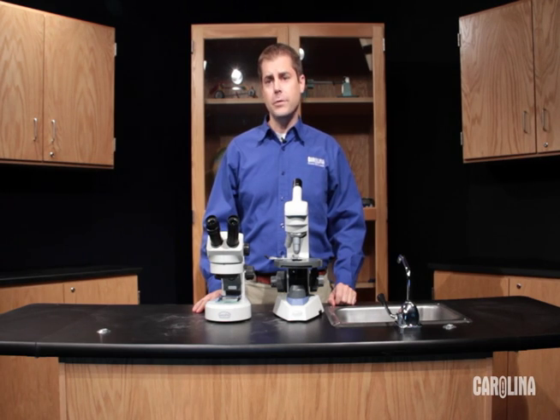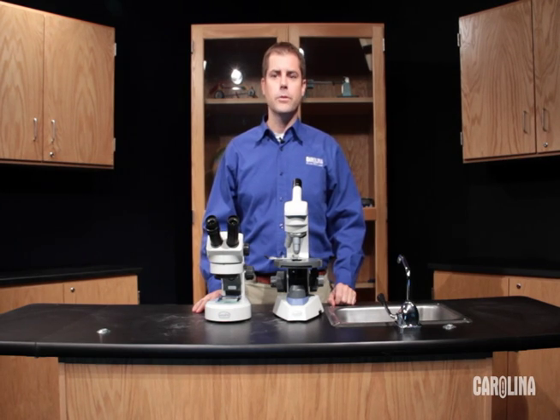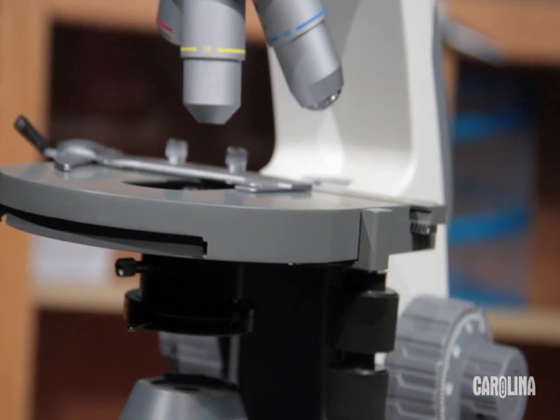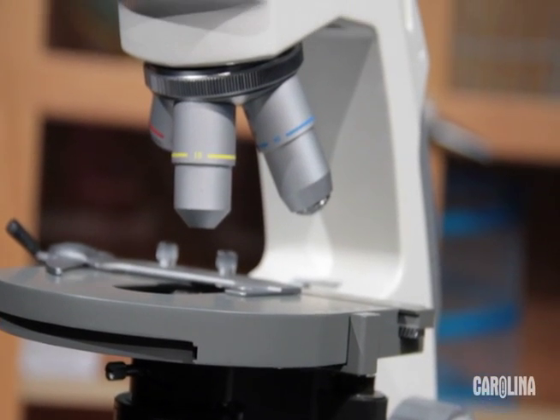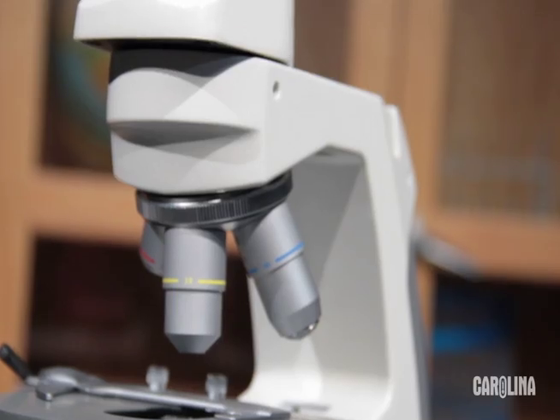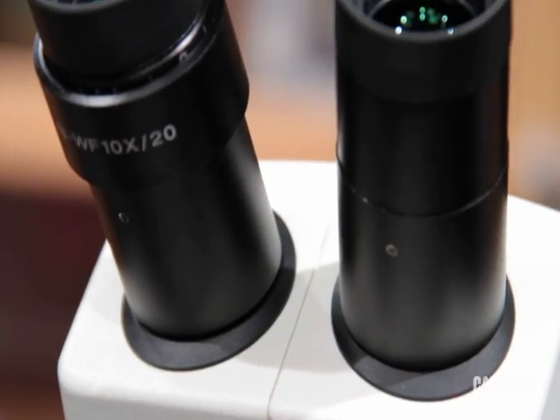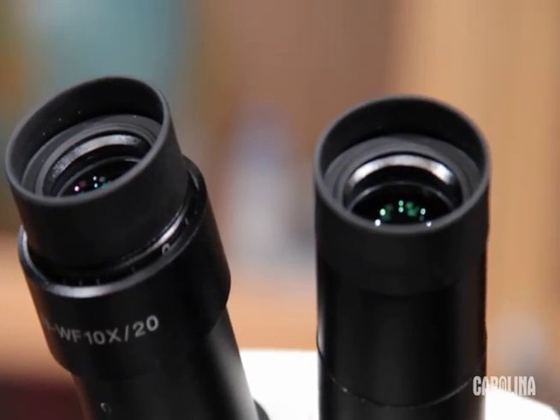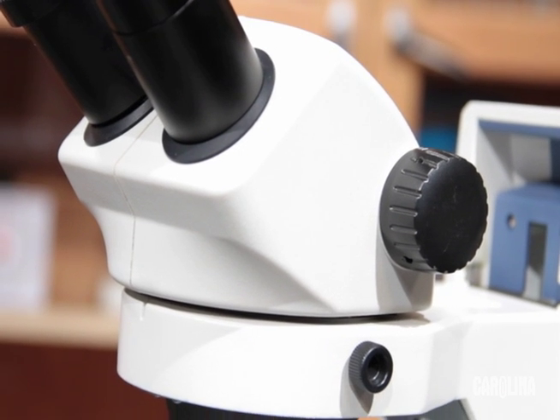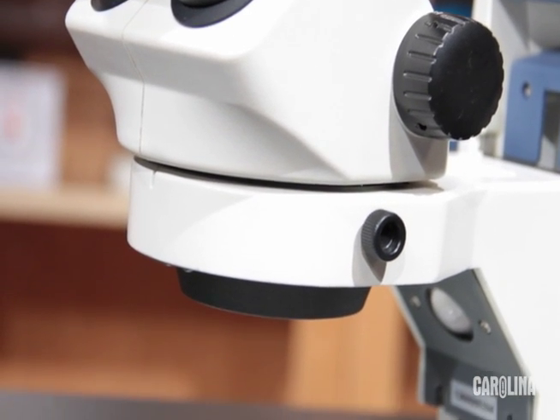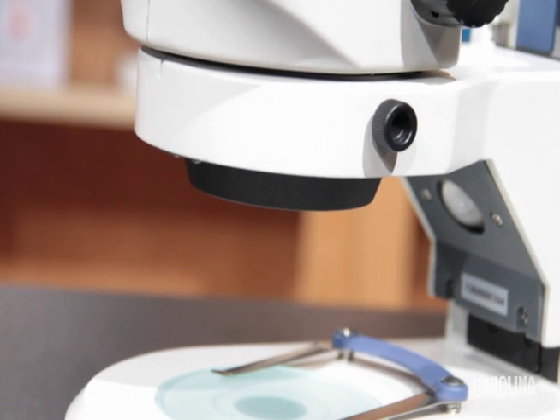First let's talk about the difference between the compound and the stereo microscope. The compound is used to look at micro objects with higher magnification and the stereo microscope has two eyepieces and two objectives so that you can see in stereo. The stereo microscope is used to look at macro organisms.